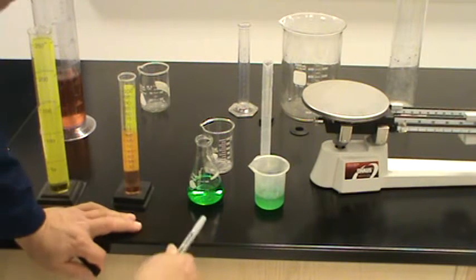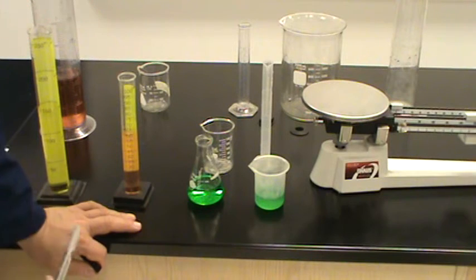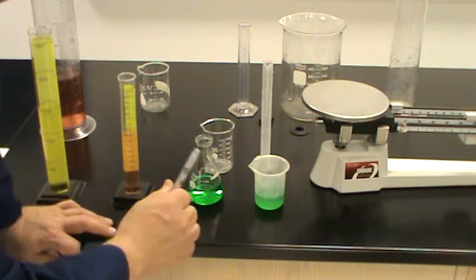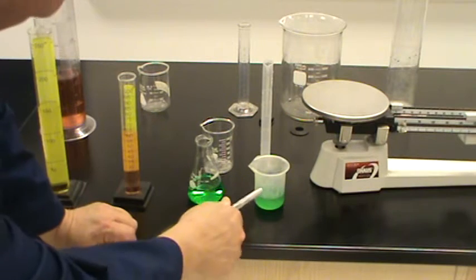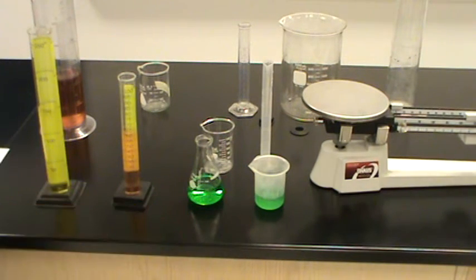The third one, this is a conical flask, and it is filled to the 75 milliliter level, but this is a 125 milliliter container. And this final one, the largest number on the plastic, and this one's very hard to see, it's 100. This is a 100 milliliter container.